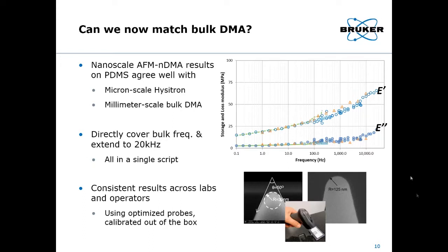Yeah, right now we're making two different versions of these. One has a 30 nanometer radius nominally, and the other one has a radius of 125 nanometers. And they are individually measured in the scanning electron microscope. Normally, you would have a hard time measuring an AFM tip radius with an SEM due to the apex being so sharp. But when they're over 30 nanometers, then this isn't such a problem, and we can get an accurate measurement of the tip radius.